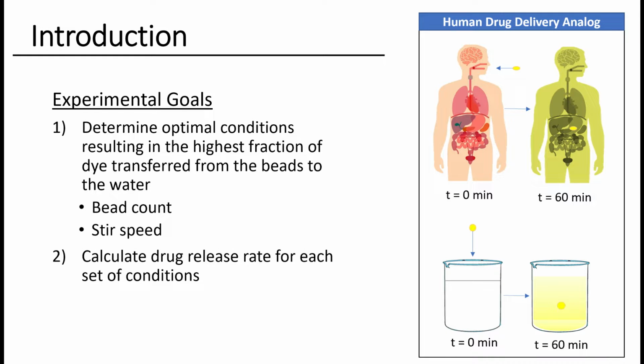Hello, and welcome to Group 10's presentation on drug delivery. In this lab, we're trying to model drug release for a spherical agar polymer drug delivery mechanism.